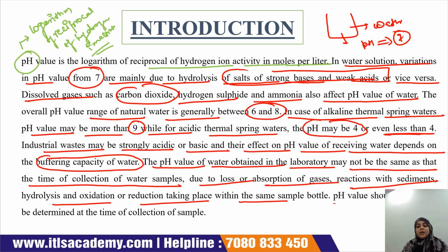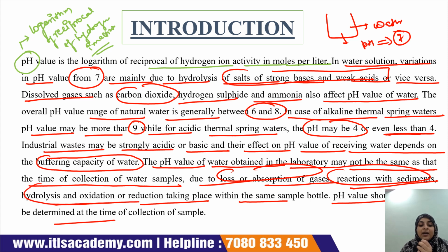The pH value should also be determined at the time of collection, otherwise its value will be affected, either by loss or absorption of gases, reaction of the sediments, and hydrolysis and oxidation or reduction taking place at the same time in the sample bottle.